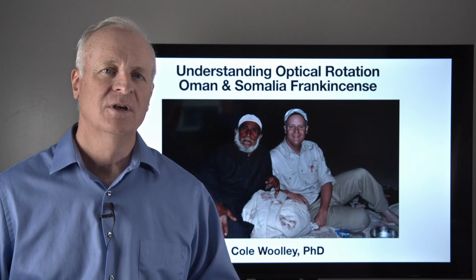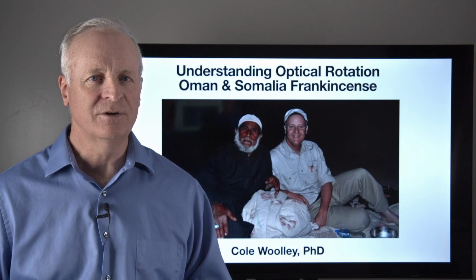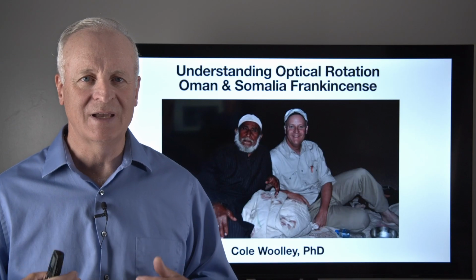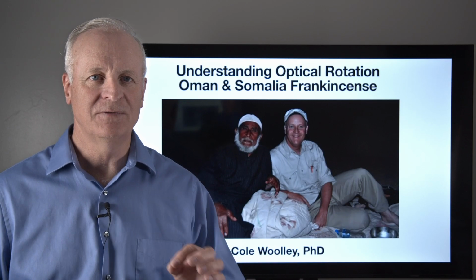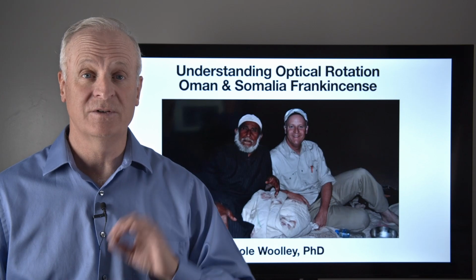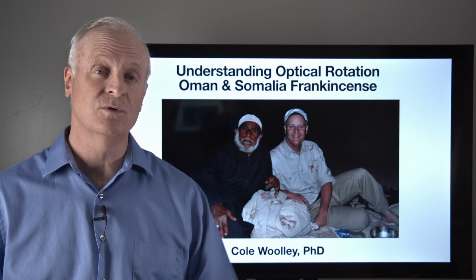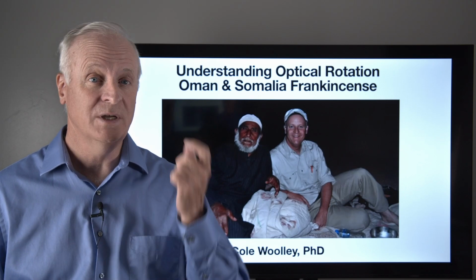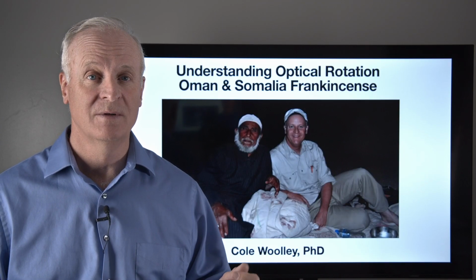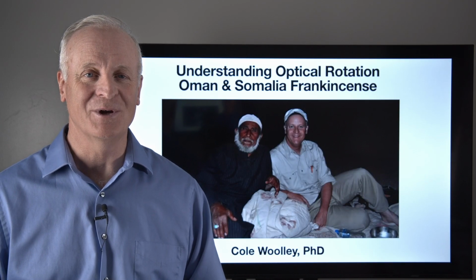So this lesson has been all about understanding how optical rotation helps me as an analytical chemist differentiate between essential oils, sometimes ones that are very similar, like orange and tangerine, or possibly frankincense from Oman and frankincense from Somalia. That's part of the continual story.